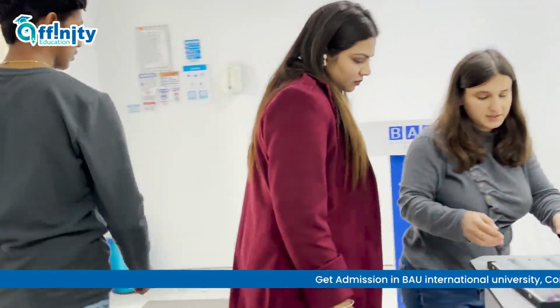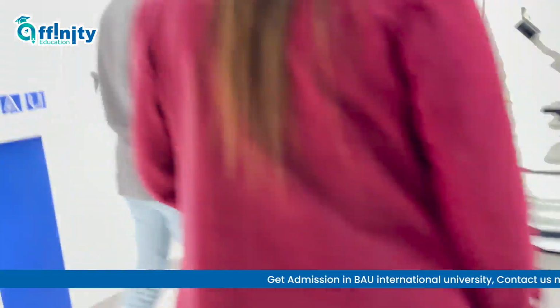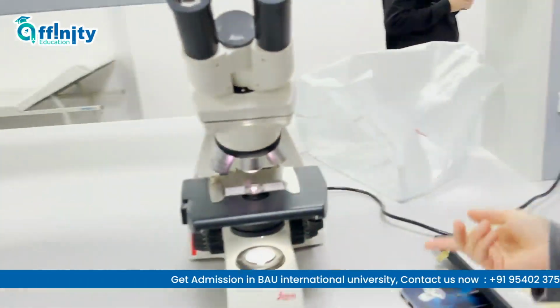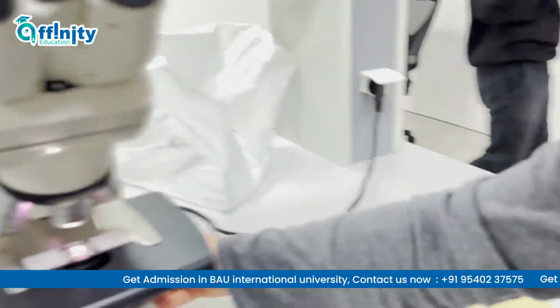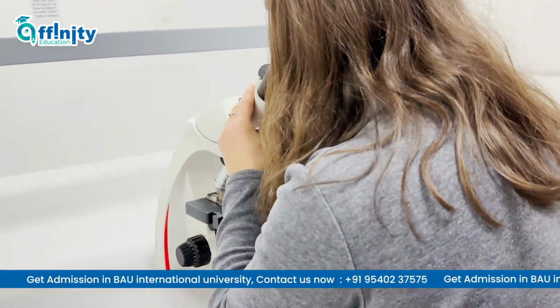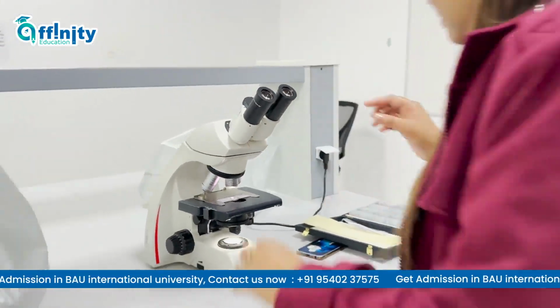Just now they are histological slides, but they can use microbes. Just now we don't have this. Because they don't use any lab. You can see this. I can see? Yes.